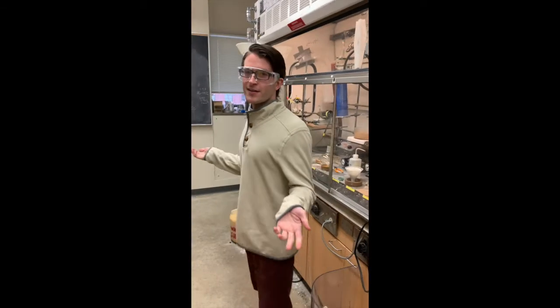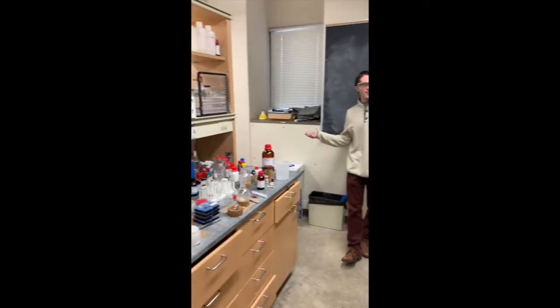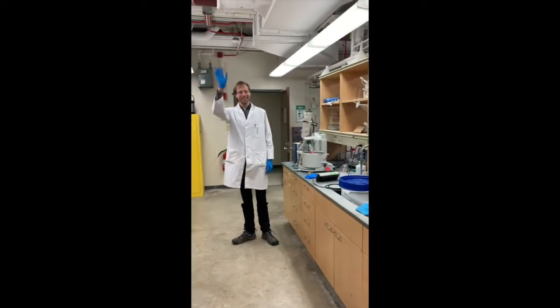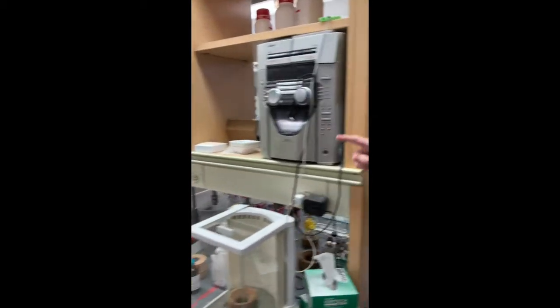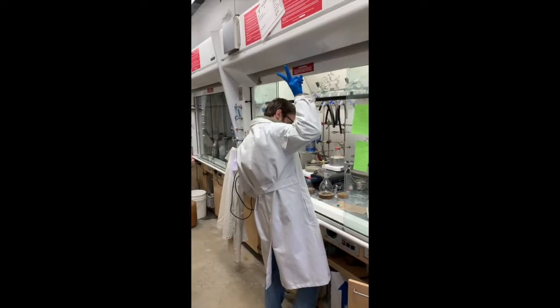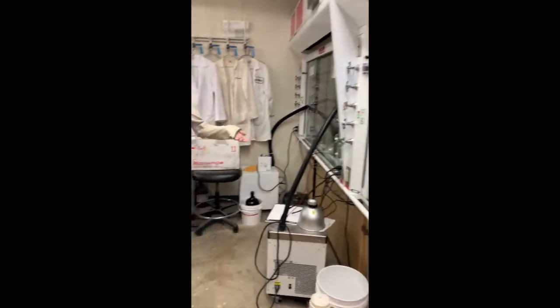So this is another one of the synthetic labs that we have in the Yoon group. And just like in the other room, every grad student or postdoc has their own bench space and their own hood. But after a while, I feel like all the synthetic labs start to look the same. So this is Sam. Sam is one of our new postdocs in the lab. And you can see on the bench tops here that every bay has their own rotovaps and ovens and balances and things like that. This is Chris. It looks like Chris is running a column right now, so we'll let him keep going.